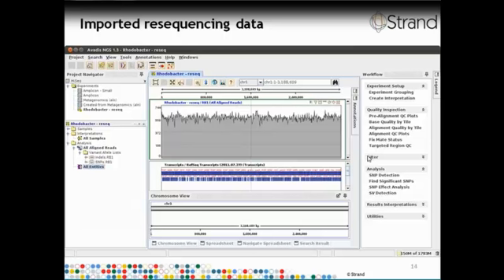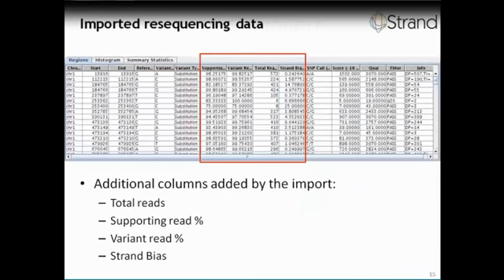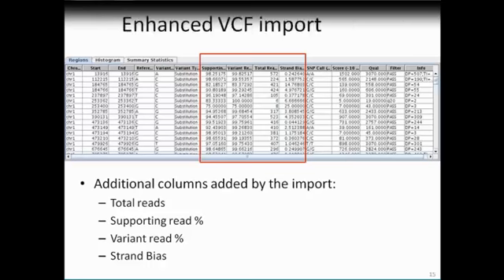When you click on OK, it creates a report where each of the variant alleles has been annotated with the consequence that it has on an overlapping gene or transcript. So you can see out here that the very first variant allele, which is the substitution of G by an A, causes a non-synonymous coding effect in the RSP1435 gene.